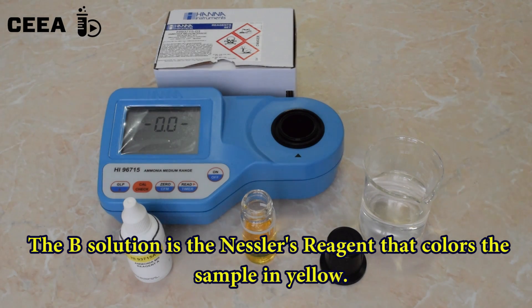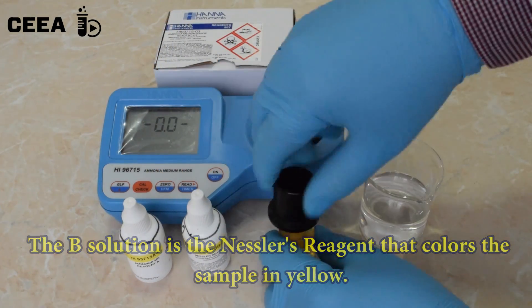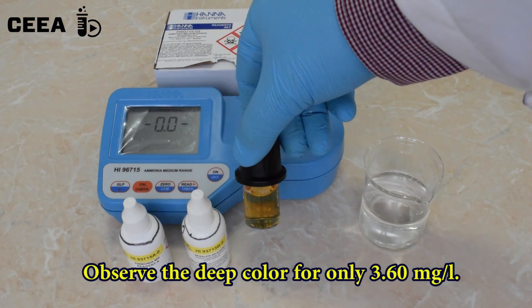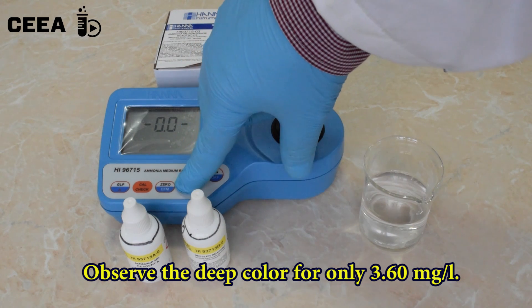Observe the yellowish color appeared after adding the Nessler's reagent. After the countdown, a concentration of 3.60 ppm is revealed.